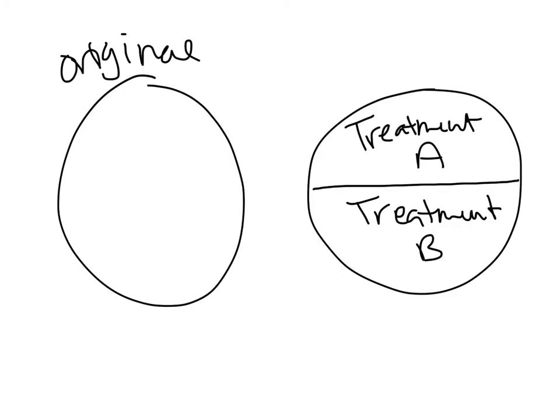It's just you're going to take this original environment, wherever you got that from, and you're going to do 2 different things to that environment. Now you'll need to make it to where you can treat half of the environment one way, and then that same environment treat the other half another way.